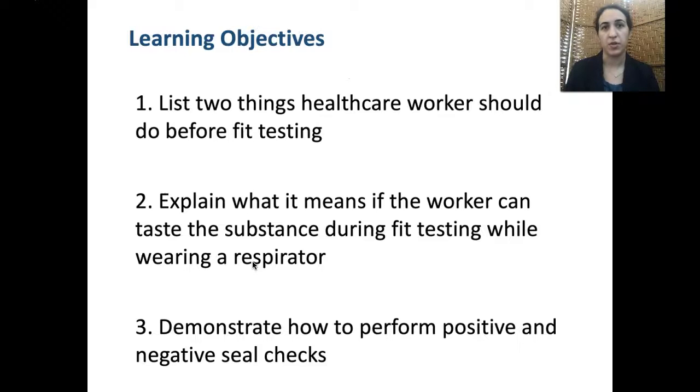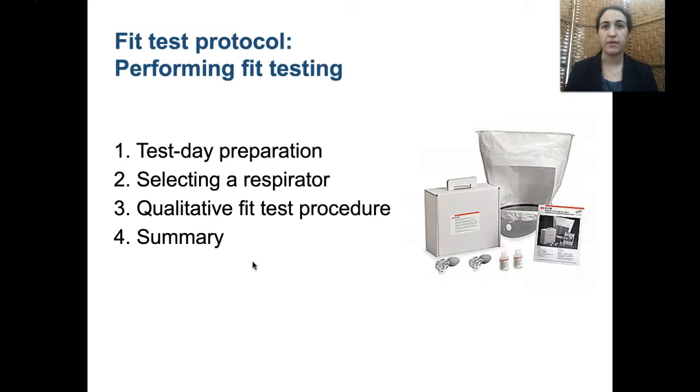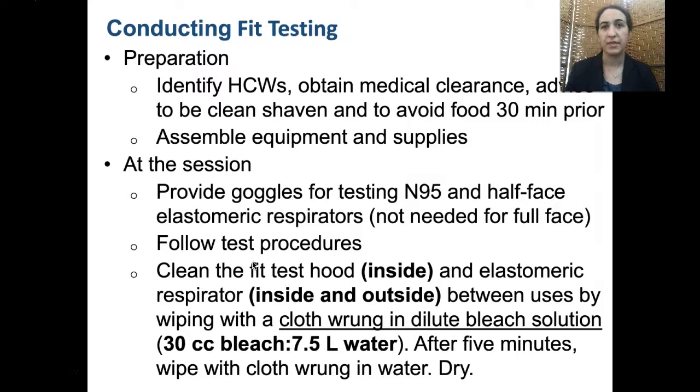By the end of this module, we hope that you'll be able to list 2 things healthcare workers should do before fit testing, explain what it means if the worker can taste the substance during fit testing while wearing a respirator, and demonstrate how to perform positive and negative pressure seal checks. In this module, we'll review how to prepare for fit testing, how to select a respirator, and the actual fit test procedure. To prepare for fit testing, you should first identify the healthcare workers who will be requiring respirators.